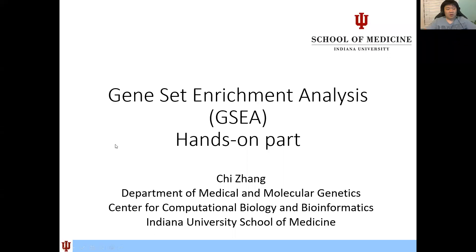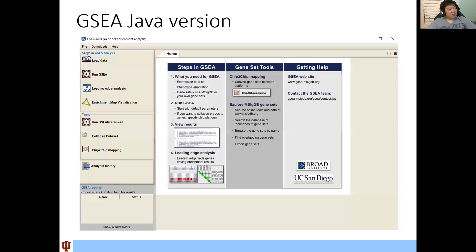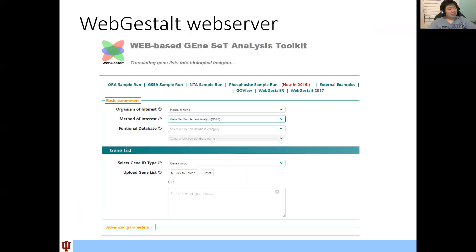Okay. Hello, everyone. Let's start from the GSEA hands-on part. So like mentioned last time, today we are going to majorly talk about the hands-on application of GSEA by using the Java version and also this web server. So let's go directly.